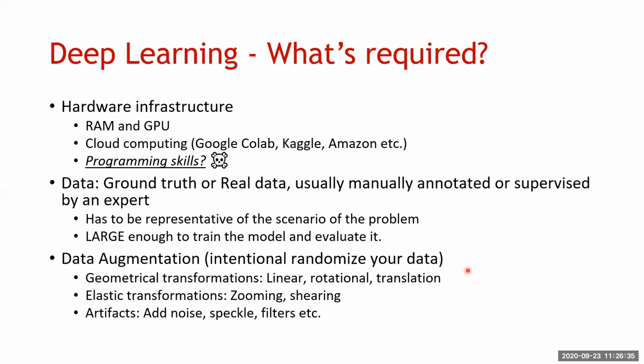You run a bunch of transformations, and you want to make sure that the network is not too biased. The one thing about neural networks is that no matter what happens, it will give you an output at the end, because you give it a threshold, it will push everything through. So you want to make sure that your model is trained accurately and well.